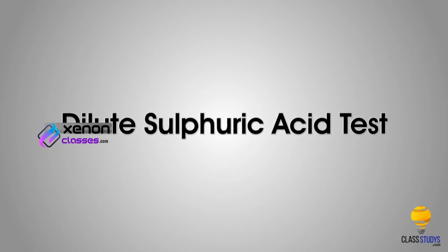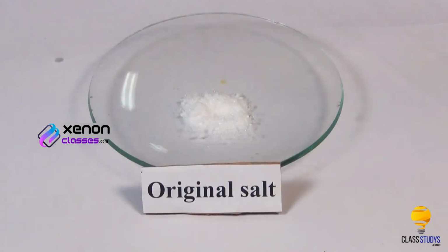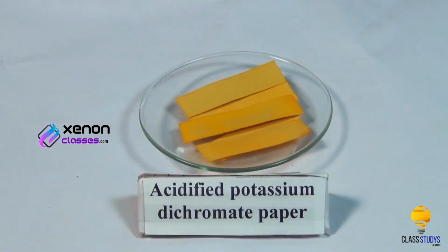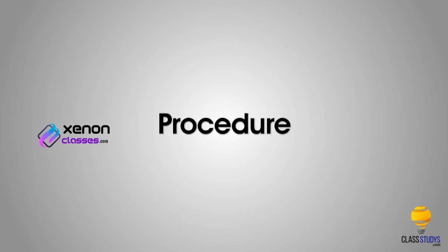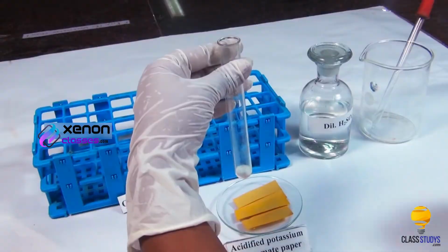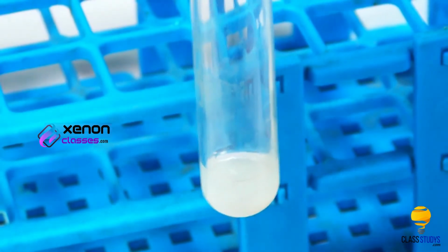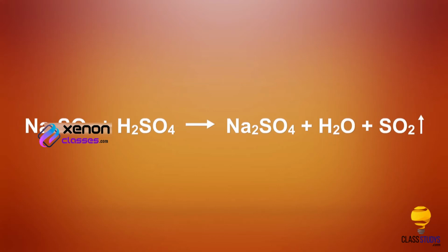Dilute sulfuric acid test. Materials required: original salt, dilute sulfuric acid, acidified potassium dichromate paper, test tube, and a dropper. Procedure: take a small quantity of salt in the test tube. To this, add a small quantity of dilute sulfuric acid using the dropper. Sulphite reacts with dilute sulfuric acid to form colorless sulfur dioxide gas with pungent smell.